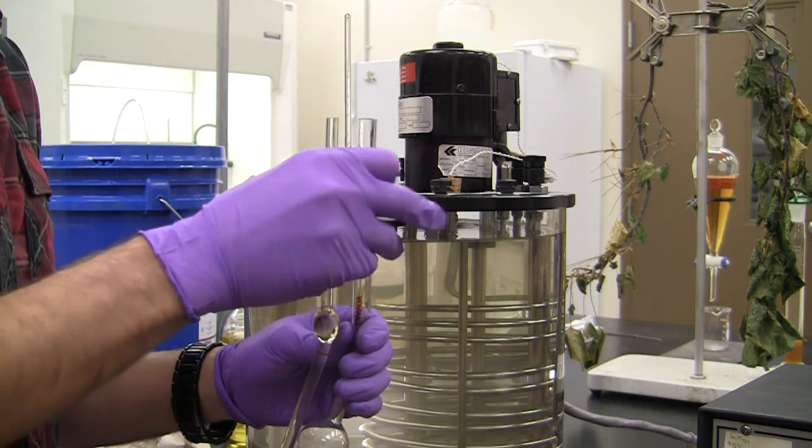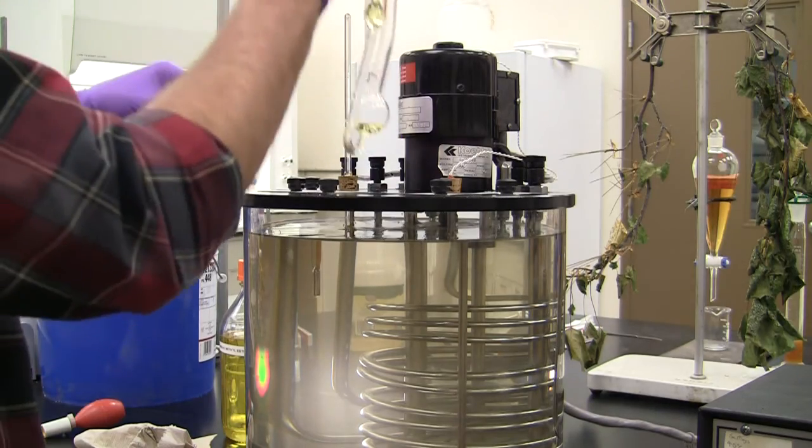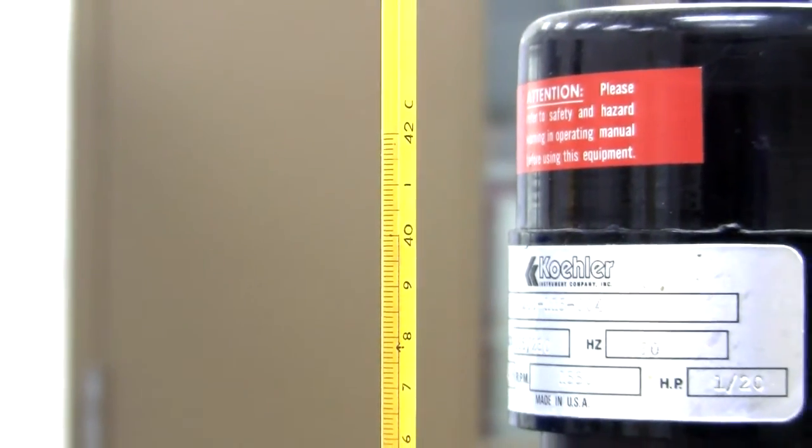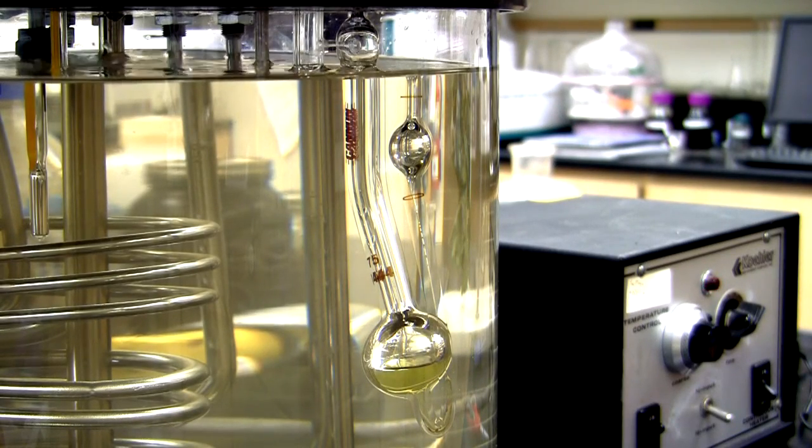Place the viscometer into the holder and insert it into the constant temperature bath, ensuring that it's aligned vertically. Allow approximately 10 minutes for the sample to come to the bath temperature at 40 degrees C and 15 minutes at 100 degrees C.